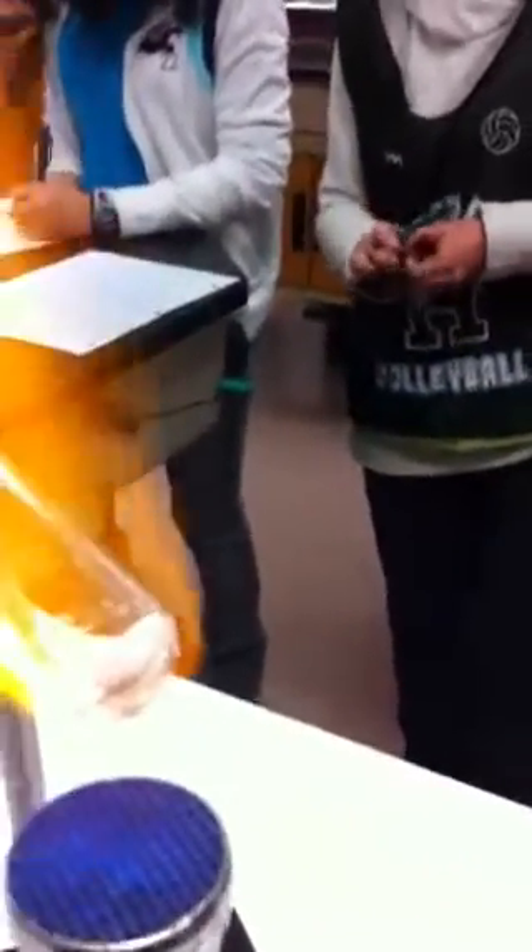So we started with a white solid, we put it in the flame, and we see some solid there and some clear colorless liquid. We must say colorless — clear doesn't work.